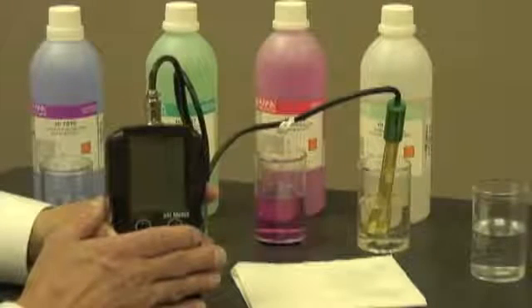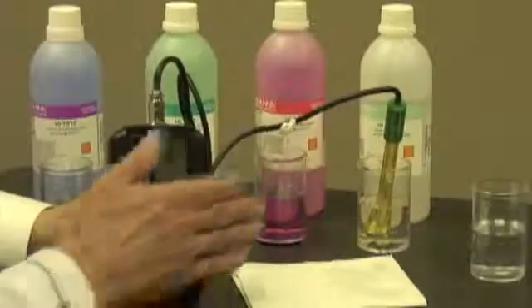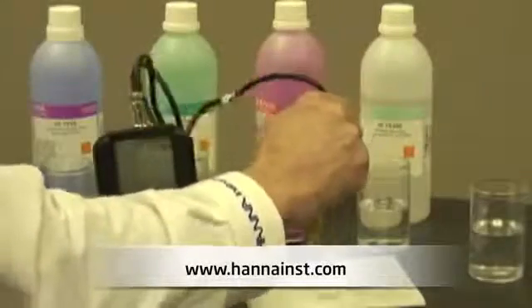I'm going to leave this in the storage solution for approximately two hours. Once the two hours is up, I'm going to take the probe out, rinse it off in purified water, then dry it on a paper towel.